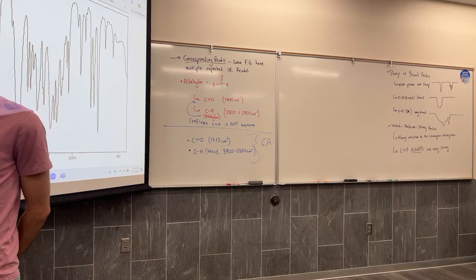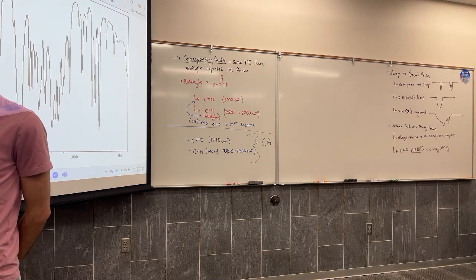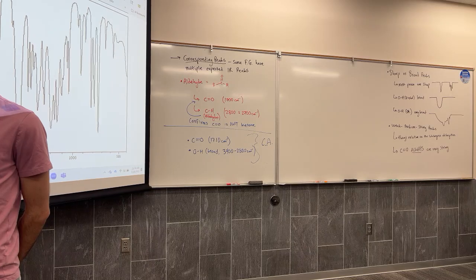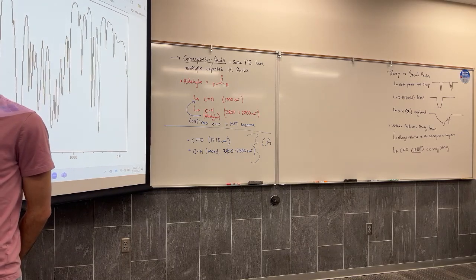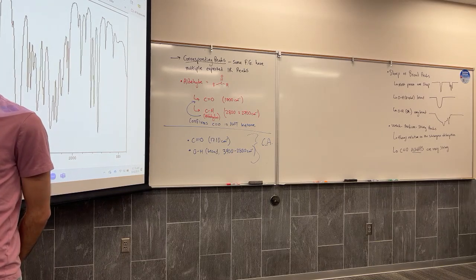Aromatic ring or an alkene, sp2 CH. So how do you know which one? Either one? You don't. Yeah, that is a challenging part.